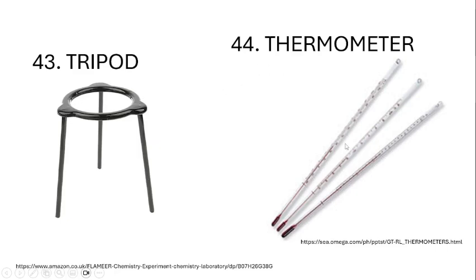Next is the thermometer. These are called alcohol thermometers, and before we used to use mercury thermometers. If you're familiar, well, I don't think you're so familiar, but if any of you can recall, in checking out the body temperature, it's the small mercury thermometers being used. But nowadays, it's digital due to the environmental laws that prohibit the use of mercury.